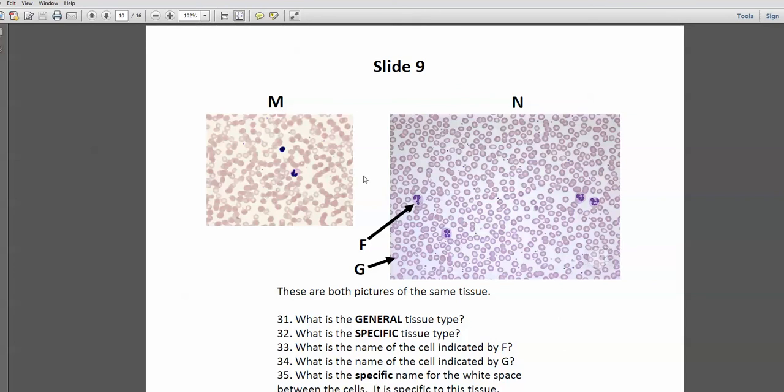No free spaces, it's not nervous. No striations, it's not muscular. So it must be connective, and indeed it is. We have lots of these little small cells and a few big cells with these lobed nuclei. So obviously this is blood. So the general tissue type is connective, specific blood.